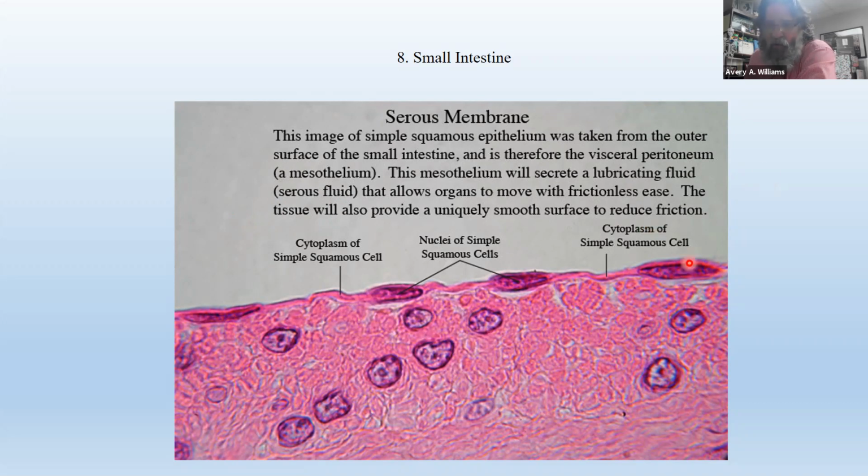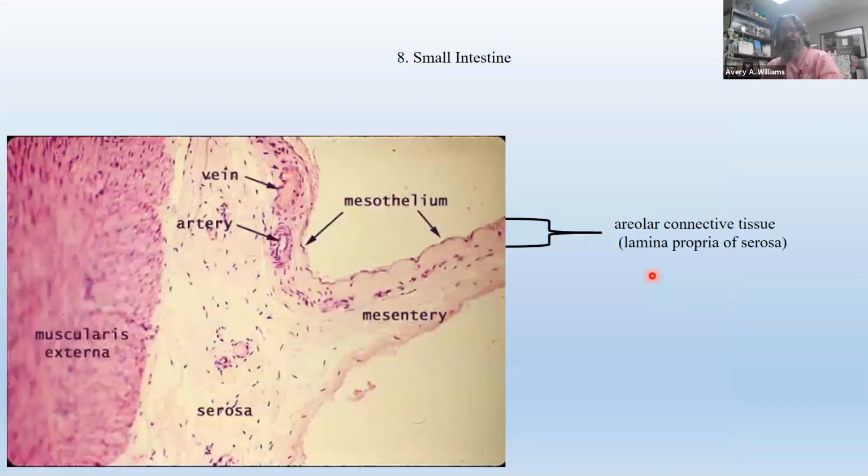Okay, so that's why you have serous membranes, to allow the organs to be nice and slick. But it doesn't have to be very thick, because there's not going to be a lot of trauma inside. So Mother Nature is very conservative when it comes to tissue. You're not going to lay down a big stratified area if you don't need it. You don't. Okay.